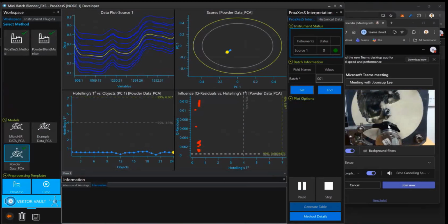There's a bit of warpage and stuff going on. You can tell by the center shaft is actually moving around. So nothing's really straight, and the tolerances we haven't got dialed in at the moment. So this front paddle should actually be closer to the Perspex window here. The spectrometer is sort of penetrating through the Perspex window though, so we are getting powder passing over that, and all this stuff here is just stuck to the Perspex. So that won't change.